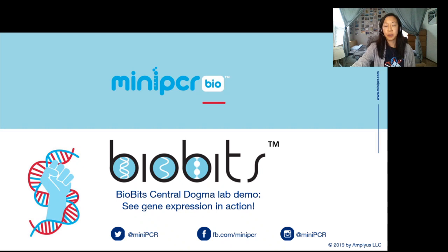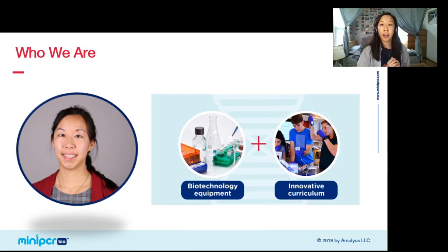Hi, thank you so much for joining me this afternoon. Today, I'm really excited to be sharing BioBits and doing a live lab with you. My name is Dr. Huang, and BioBits and this lab are something that I developed in my PhD when I was at MIT. Last year, when I graduated from MIT, I joined Mini-PCR Bio. For those of you who don't know who we are, Mini-PCR Bio is a small company based out in Boston. We make biotech equipment as well as really innovative curriculum for you to use in your classrooms. Today I'll be showing you an example of one of our really innovative curriculum to cover gene expression that really hasn't been done in this way before.